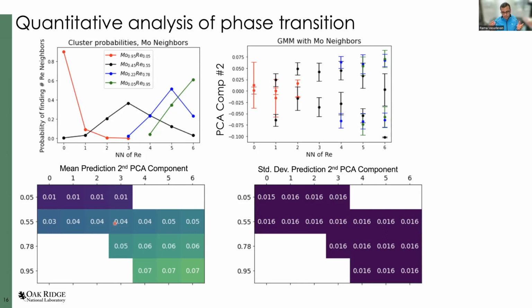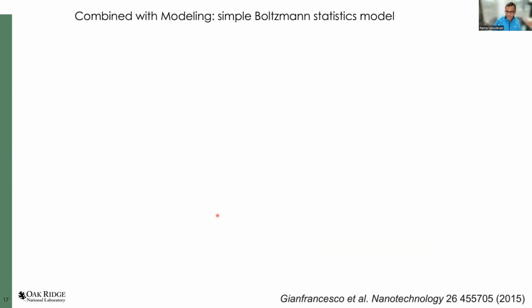We just looked at what the data was showing us, and we tried to predict whether the global composition is a better predictor of the symmetry breaking transition, or whether the local chemical environment is a better predictor of that transition. And so clearly, from this study, it shows that although there is an effect of the global composition, it's quite small with respect to the effect of the local chemical compositional changes that we can actually see in the sample.